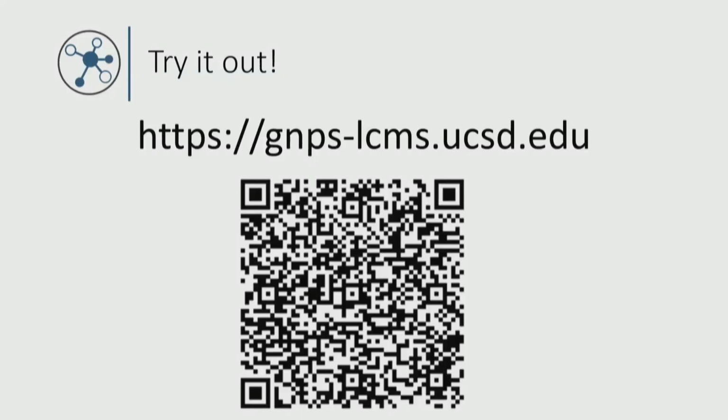Thanks a lot for the question. First of all, I think the connection between the data and your study needs to be made somewhere, for example in your manuscript. And for annotation, I think we're not actually going that far yet, like communicating confidence in MS annotation. Here we're asking really low level questions, like is the right m/z, within a certain error mass, found in your actual data?